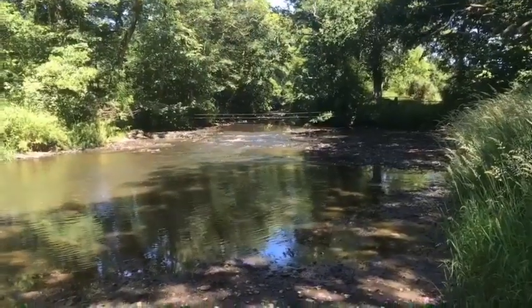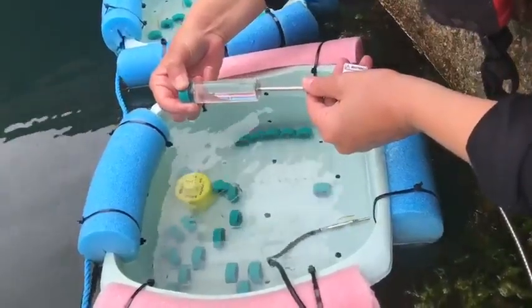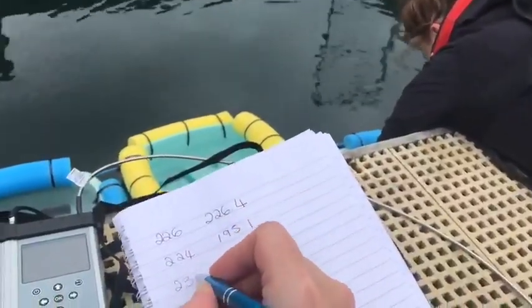We've collected samples from multiple sites from the river and the estuary and we've incubated them in the marina in the natural environment. Today is the second day of taking measurements.